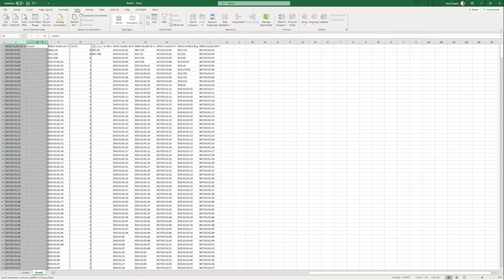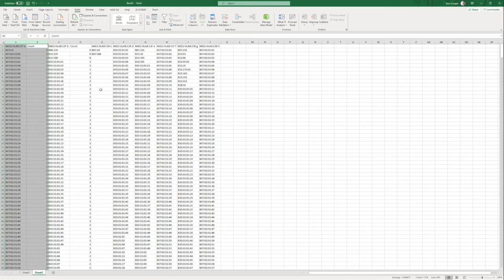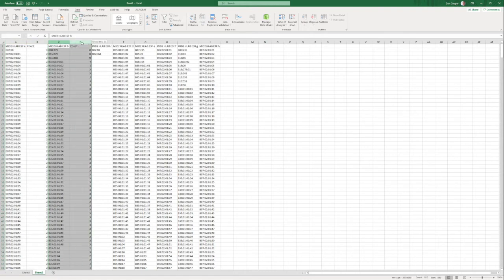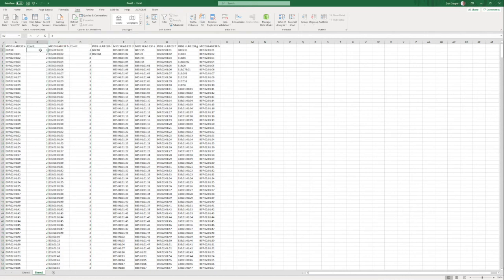And we'll sort the first two columns based on the count. And we want the largest count to come to the top of the pile. And the same with the next two columns. Sort them by count, and the largest to the top of the pile. So woohoo, look at this. We have only one allele, which we called for exon 2 forward in the A consensuses, which occurs 3 other times. So we're able to confidently say now that one of the two alleles that was present in this sample for HLA-B was B0710.